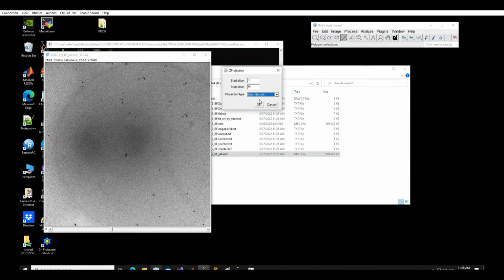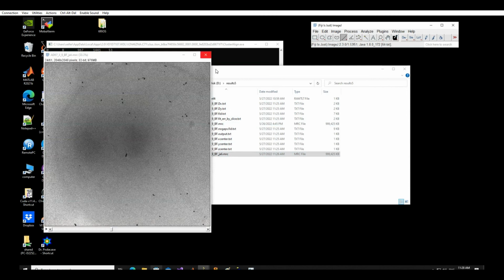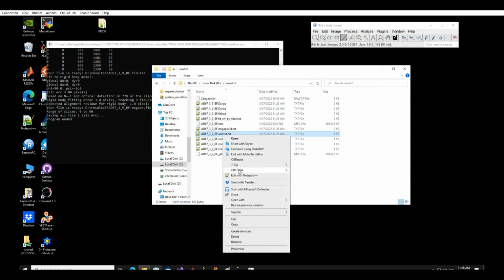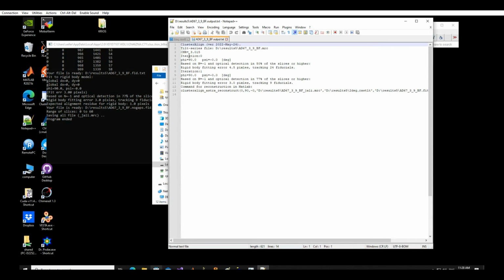In a standard ALI file, the images will be rotated by 90 degrees and appear with a vertical rotation axis. Here the trajectory should be vertical and straight. The output.txt file is a summary of the alignment performance.